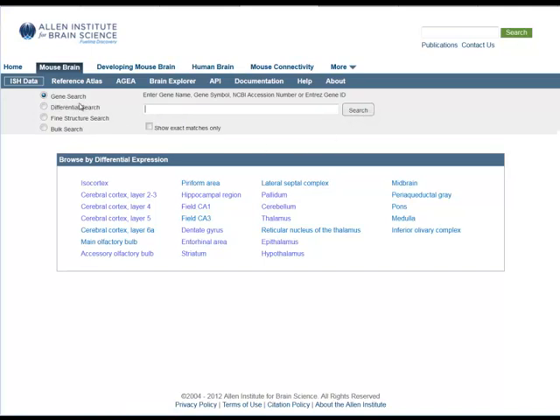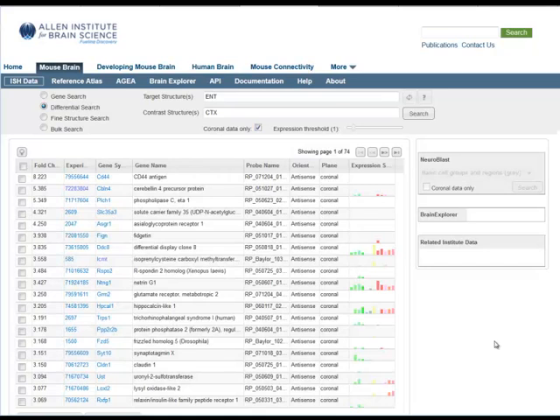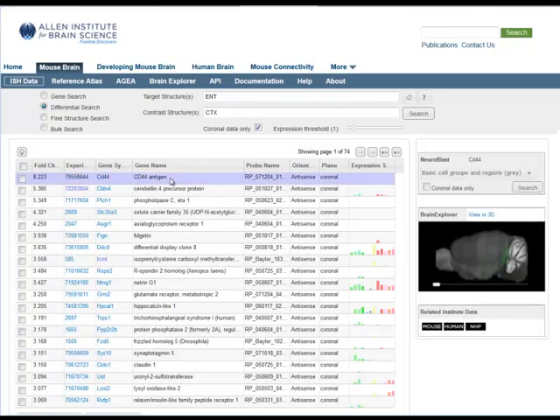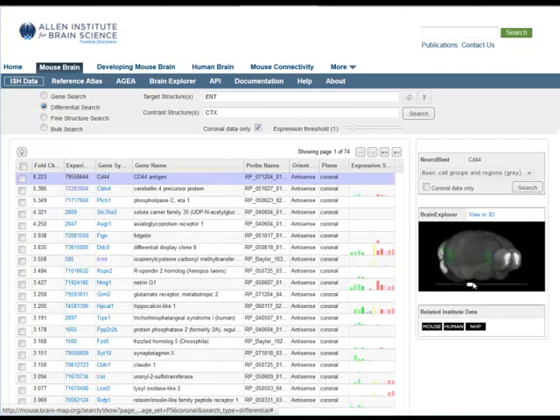I will look for enhanced gene expression in the entorhinal areas by clicking on that structure in this list. What gets returned are a list of experiments that fit your selection criteria. Since only the coronal data set includes data from across the entire brain, choose coronal data by checking this box.